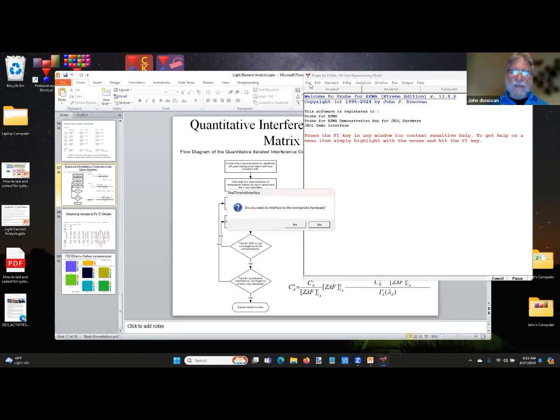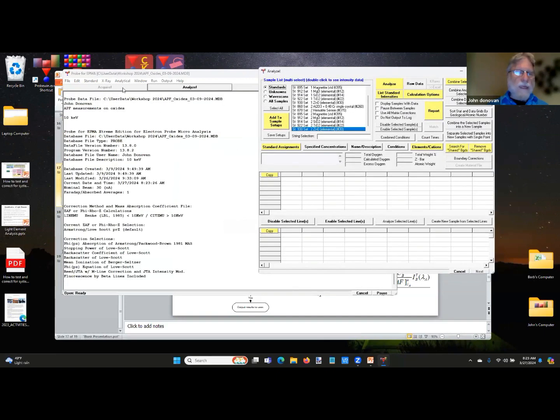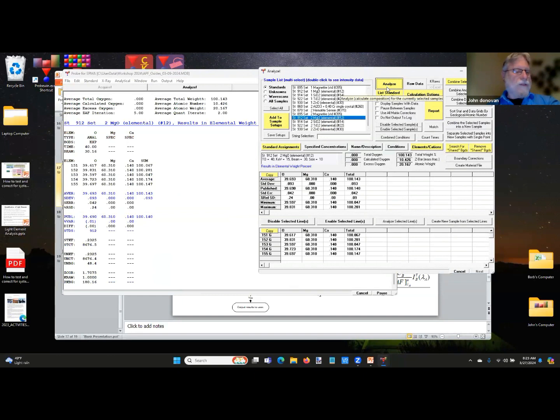And let's look at, I'm going to go to, yeah, let's do this one. Röntgen again. And so if I, again, go to that analytical options window, I've already turned off all these options here, good. And now I'm going to first analyze MgO. I'm going to just look at my notes, make sure I don't forget anything. Oh, yeah, okay, good. So there's MgO. We're getting a good analysis of MgO. Of course we are, because it's our standard.